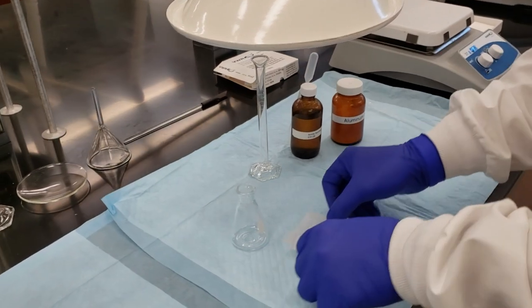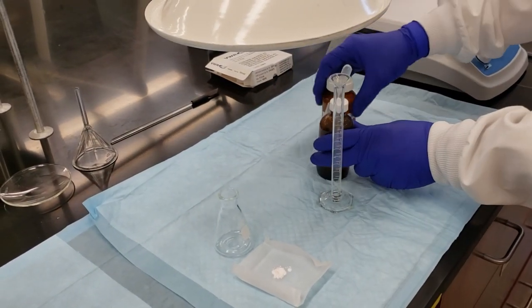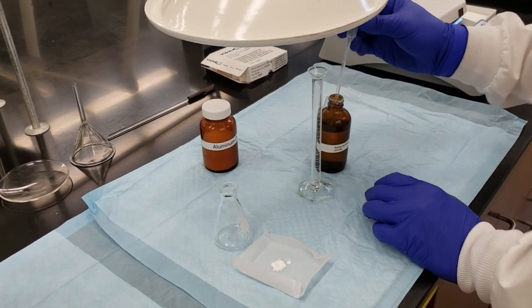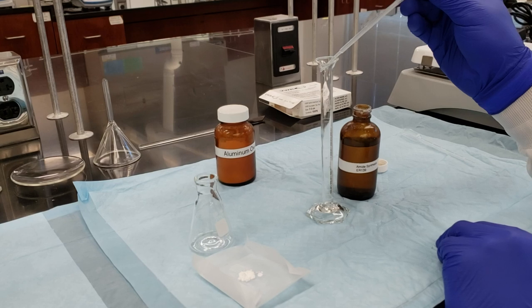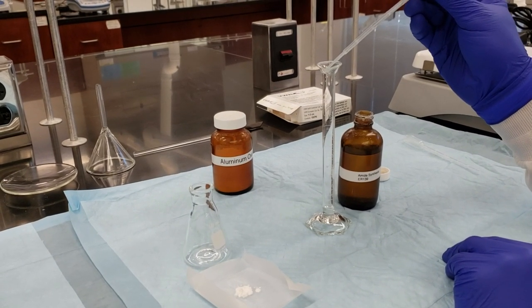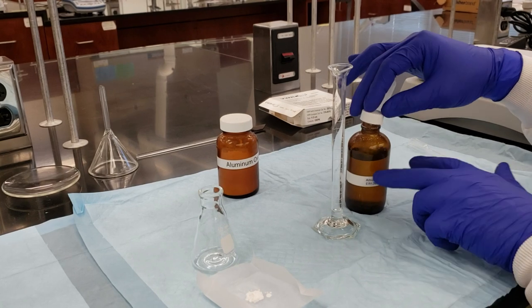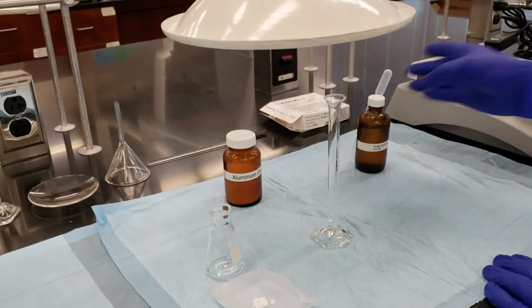I'll set these two aside for a moment, and let's measure out our amine. The amine has a very pungent smell, a very strong odor. So we're going to be measuring this out very carefully underneath our snorkel. And there we go. There is our 1 mil of our amine.